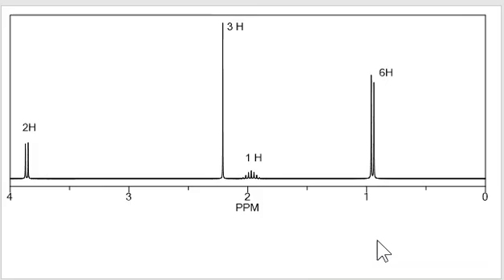Interpreting proton NMR spectra offers an excellent opportunity for you to create your own system for organizing and interpreting data. As there is no set order in which chemical shift, multiplicity, and integration must be analyzed, you may develop your own approach as you solve NMR problems. So what I'm going to talk about is a starting point for solving a structure from the proton NMR.